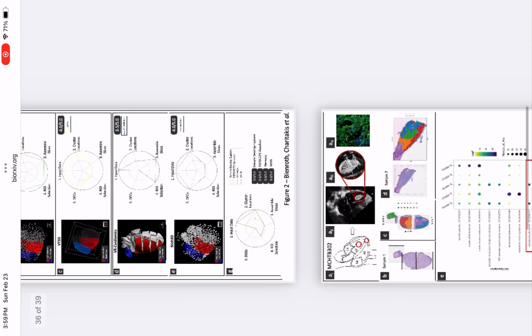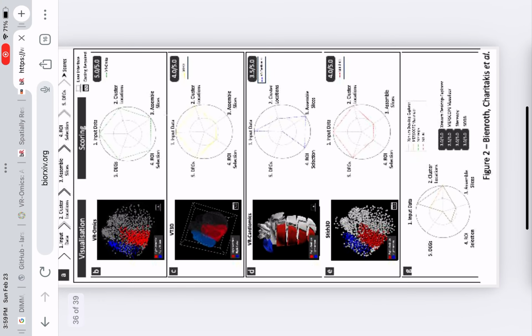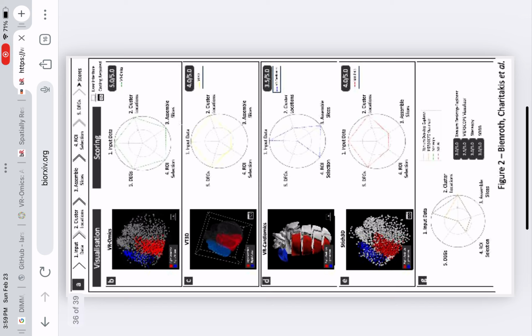Through the analysis of rare CRM samples, we demonstrate that VR-Omics overcomes 2 major challenges in multi-slice coplanar ST data. 1. Biologically adjacent samples being separated for processing which need to be merged for analysis, and 2. Inter-sample comparisons. VR-Omics' capability to analyze multi-slice datasets and easily perform inter-sample comparisons permitted the elucidation of key molecular mechanisms contributing to the growth of rare cardiac rhabdomyoma samples. The workflow available within the VR-Omics framework identified shared signatures of increased aerobic respiration across patients within abnormal cardiomyocytes faster than comparable workflows implemented across multiple disaggregated packages.